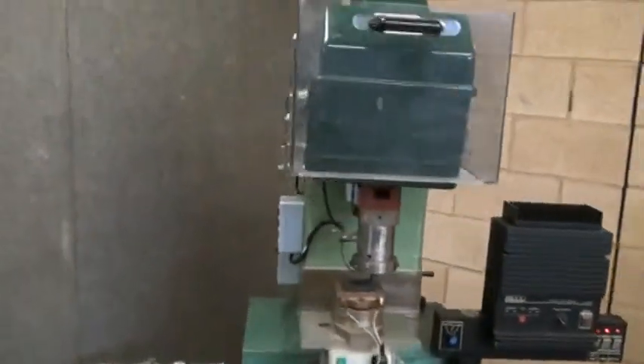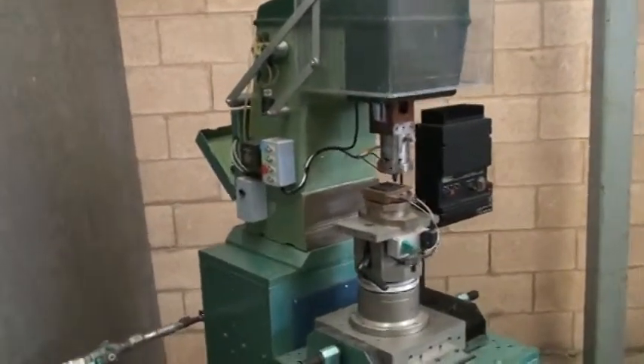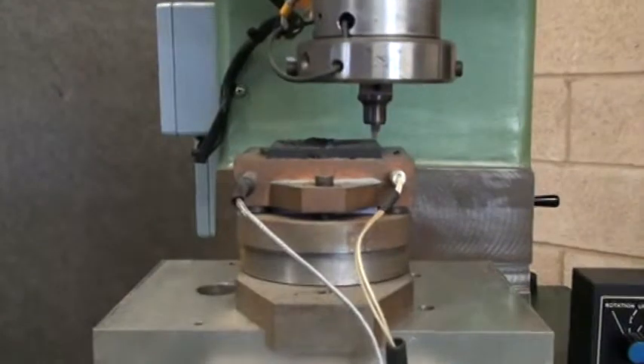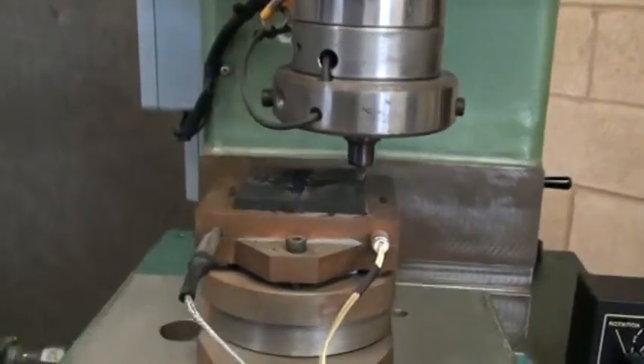The machine was built on a knuckle press frame, so the platen is stationary currently and the top will come down into the sample.